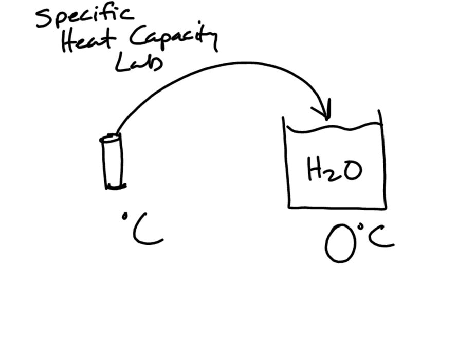That temperature regulation should mean the metal is the same temperature as the inside of the incubator. So make sure you look at the incubator and find out what temperature it's at, because that will be your initial temperature, so to speak. I don't know what that is off the top of my head, but it's probably somewhere around 60 degrees, but you'll need to double check.